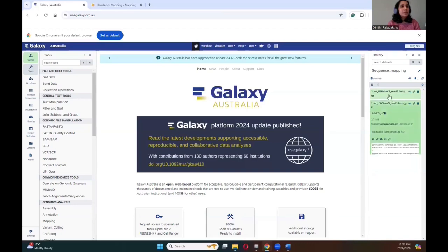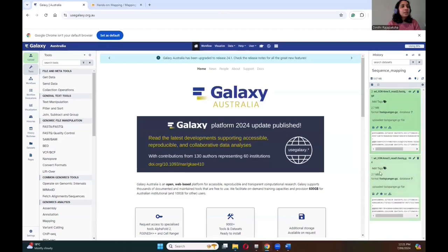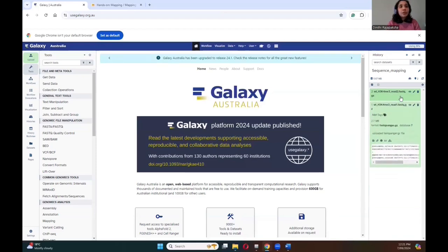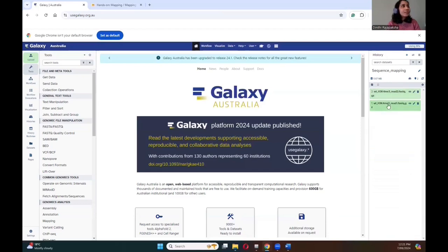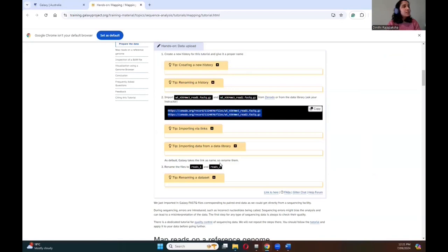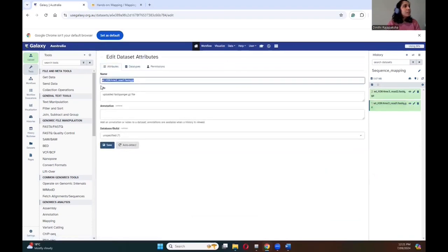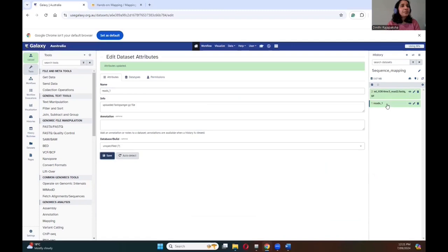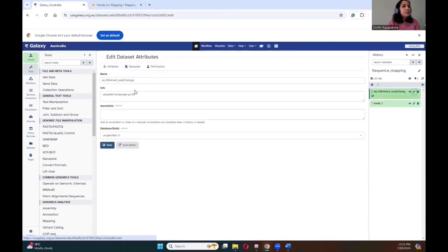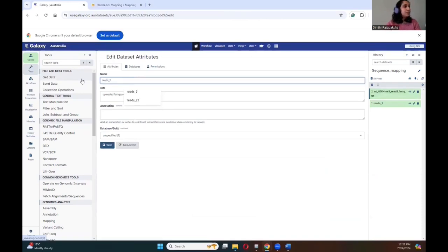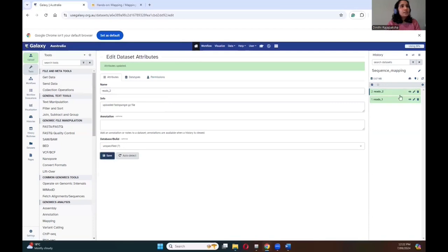The datasets are now loaded. Here you can see it's 2.7 megabytes, which is quite small compared to actual datasets you will be working with, but for the sake of time the datasets are downsized. Before starting the analysis let's rename the datasets because the names are quite long. As suggested in the tutorial we will rename them as reads 1 and reads 2. Using the edit attributes option, simply type reads 1 and save. We'll do the same with dataset 2 — reads 2. The data is now ready.